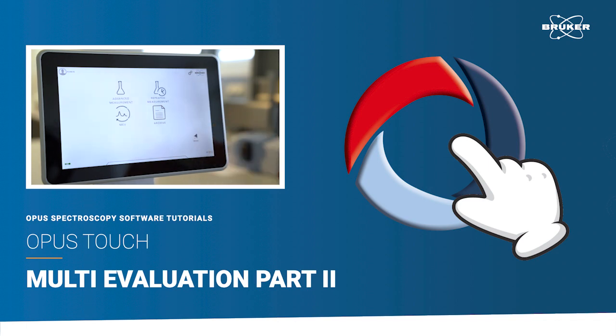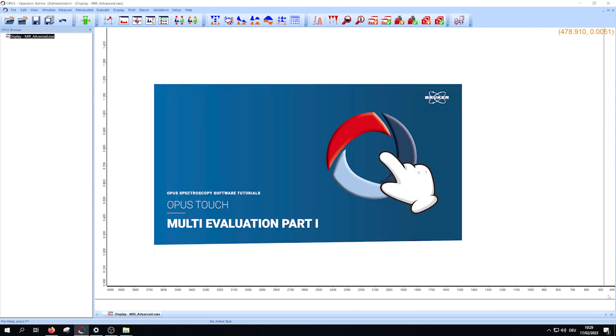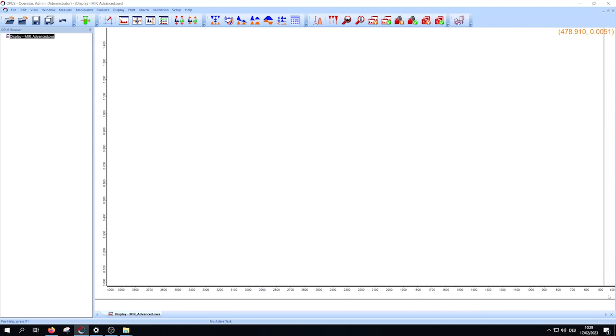Hello and welcome to the second multi-evaluation method tutorial. In the last video we learned the basics of the multi-evaluation method, short MEV.